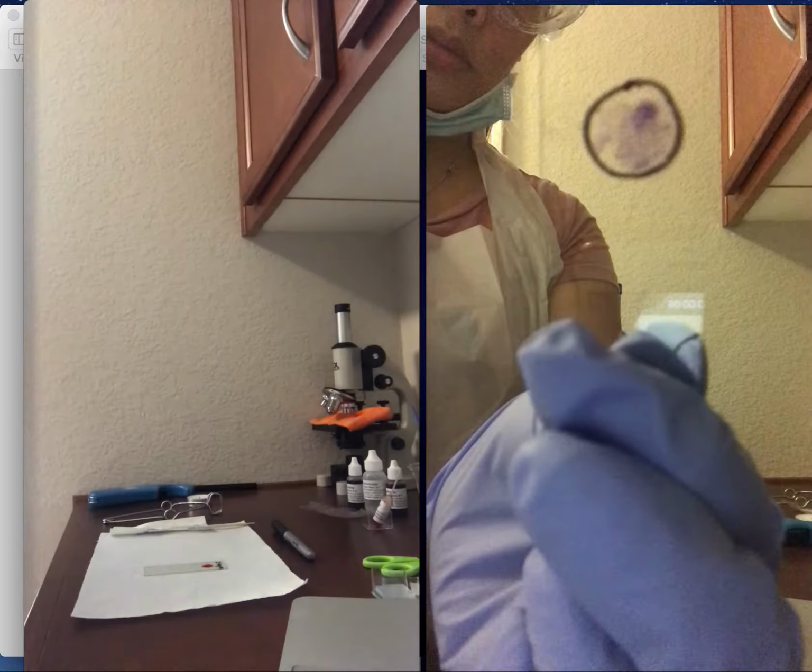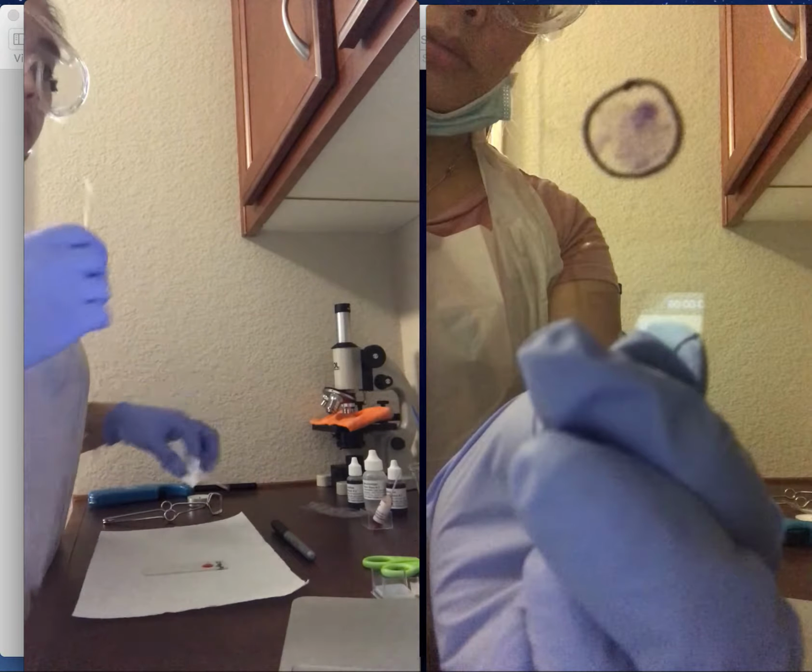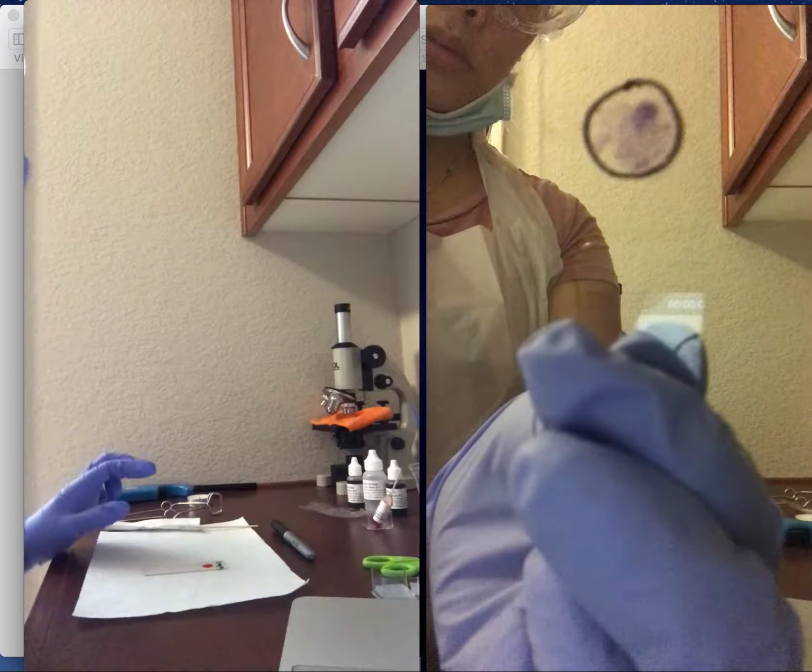Then we get another sterile swab and scrape the inside of our mouth around the teeth and gums.